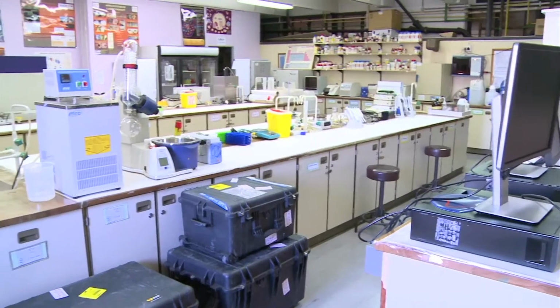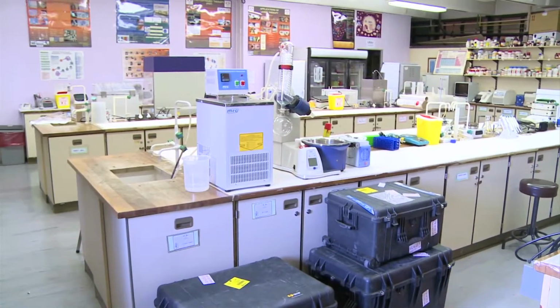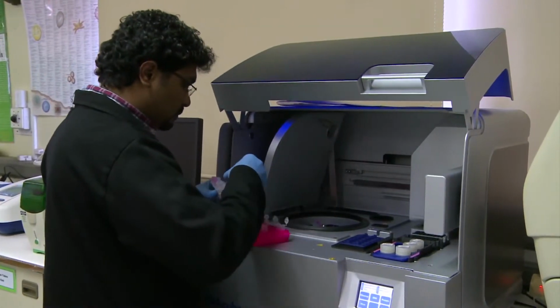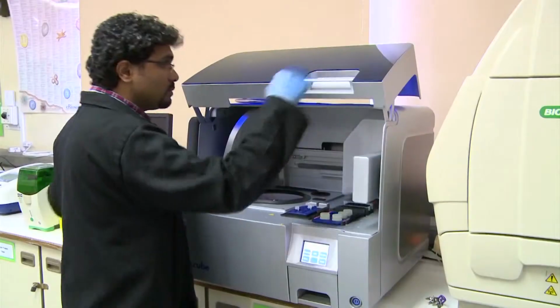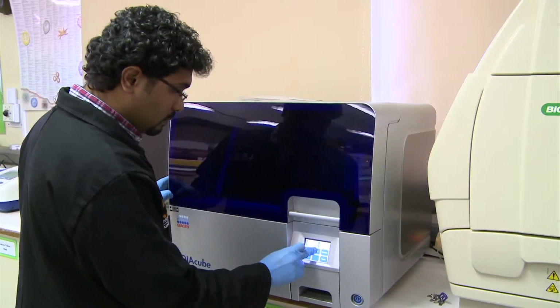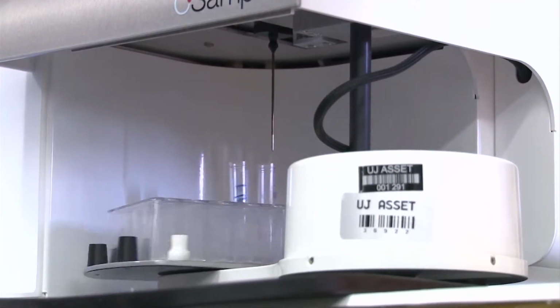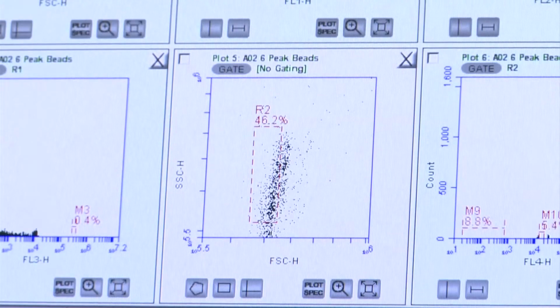So our laboratory is a state-of-the-art laboratory. We've got the tissue culture facilities where we will grow our cells artificially. And then to study the biochemical tests or the downstream effects of the light on the cells, we have equipment like a flow cytometer, which can count exact number of cells, for example, dead cells or live cells. We've got a PCR machine, which looks at the gene transcription or the expression of certain genes within cells.